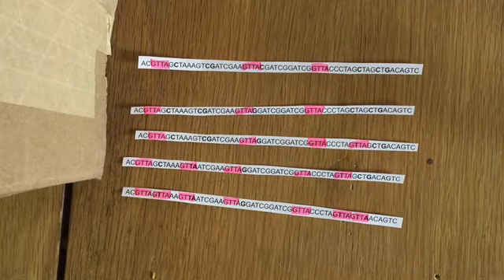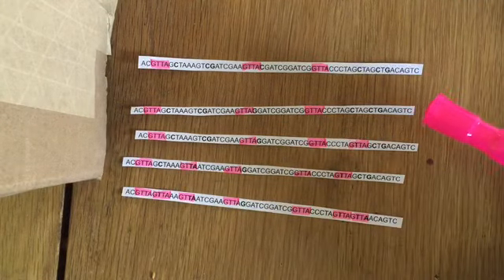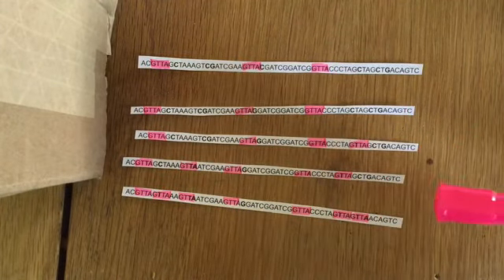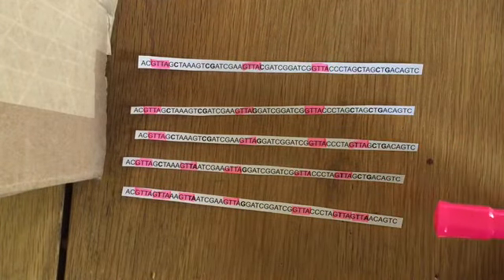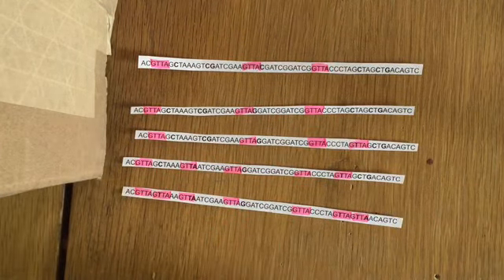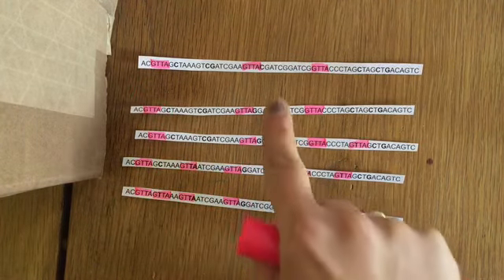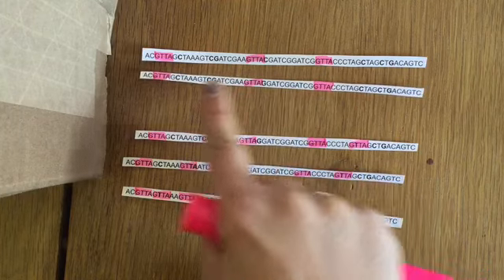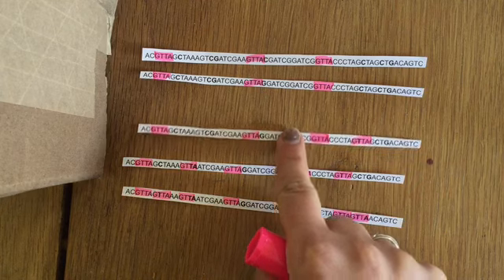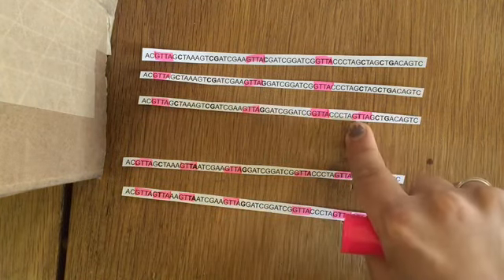All right, so I've gone through, and if you notice, this is the DNA sequence for cytochrome C. I very much simplified it. In a real organism, this would probably be like 600 or 700 bases long, so I've obviously made them a lot shorter and simpler. So what happens is we can see between the human and the gorilla, they only have 3 what we call restriction sites. Well, here, the chimpanzee had a mutation right there.